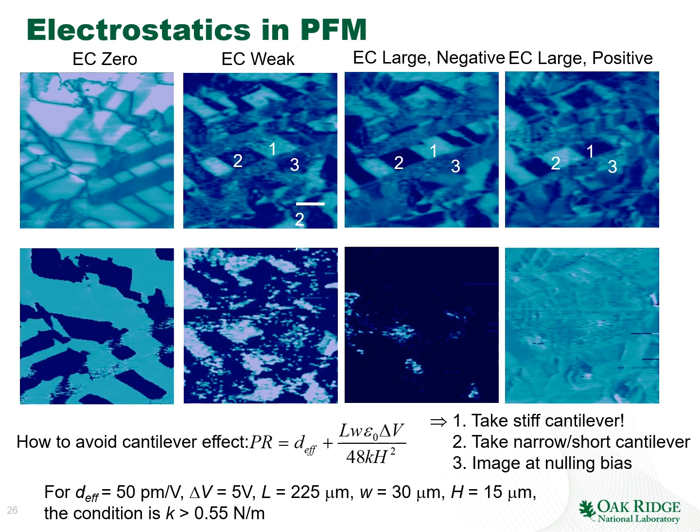So it's possible to estimate the magnitude of this electrostatic force contribution as shown here. It depends on the length of the cantilever, the stiffness, the potential difference, and the spring constant. Generally, for typical material parameters, for example a 5 volt drop between tip and the surface, about 200 micron cantilever length, 30 micron width, and 15 micron tip height, for an effective piezoelectric constant of the material of 50 picometers per volt, the critical condition is about half a Newton per meter.